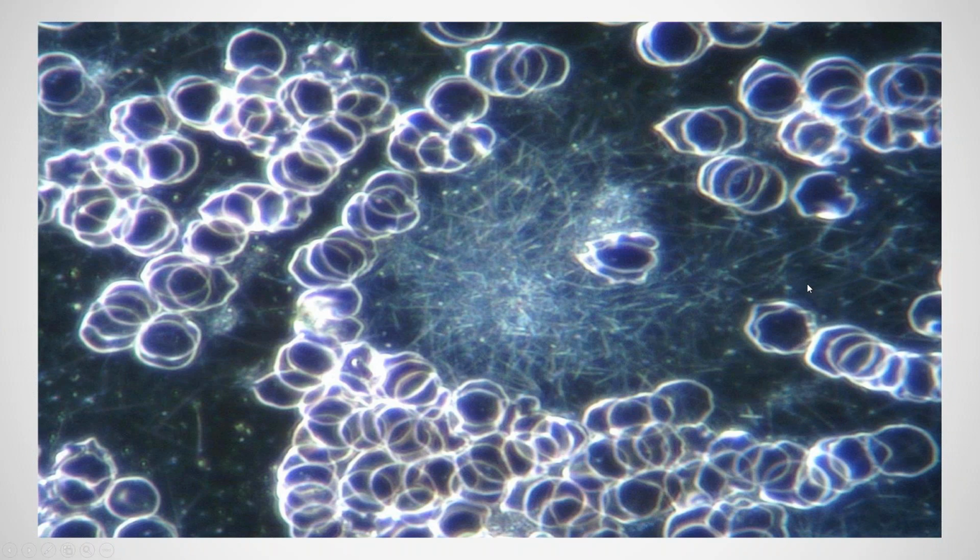So with a basic system that doesn't have the required specifications and the required high degree of contrast that we need in dark field, you won't be able to see these lines at all. These are not really visible in bright field either. In a phase contrast system, you might be able to see some of these lines here, but it won't be nearly as extensive as what we're able to see here in dark field.